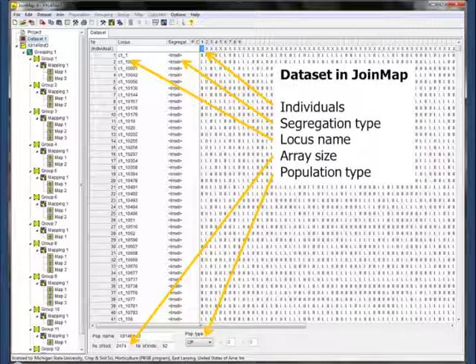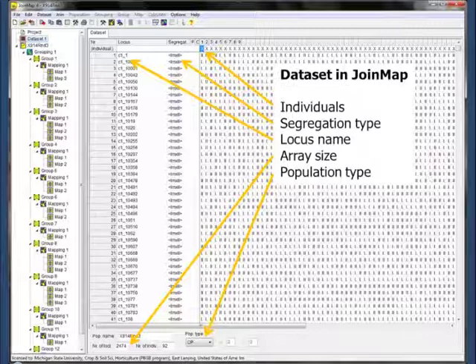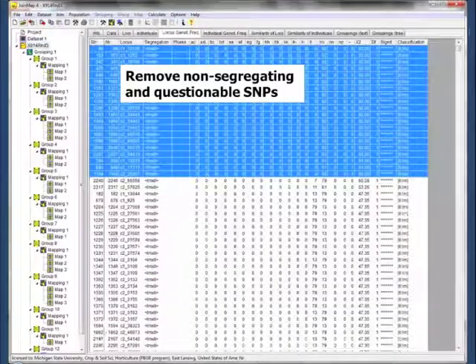We had them denoted whether they were candidate genes or genetic markers, just to see where they were all falling out. You can play around with this — right now these are just the SNP names we're using, but you could put some other parameters into that if you wanted to. So here's the array size. We ended up with the DM by 84SD22: 2,474 markers, 92 individuals, and the population type we use is cross pollinated.